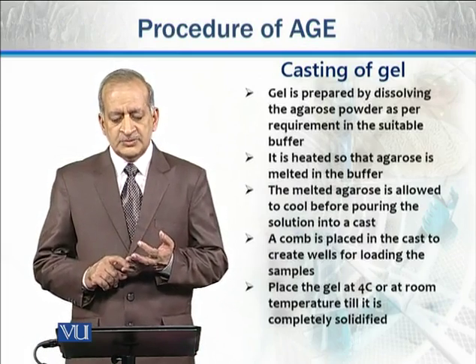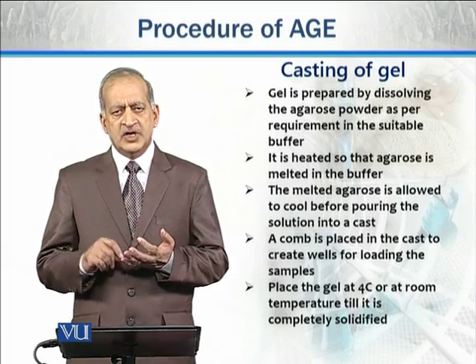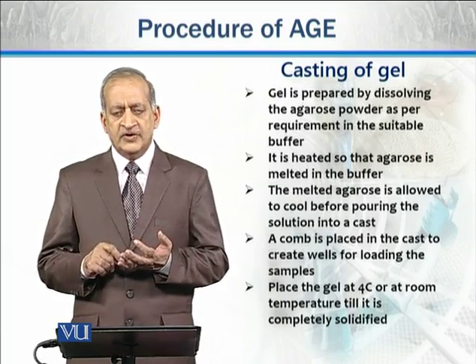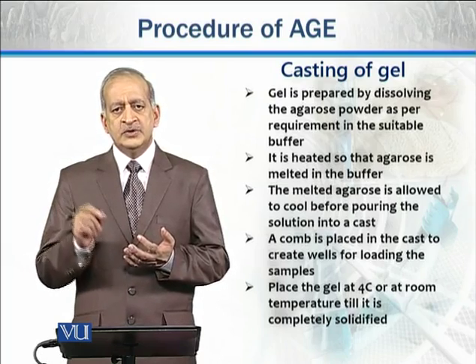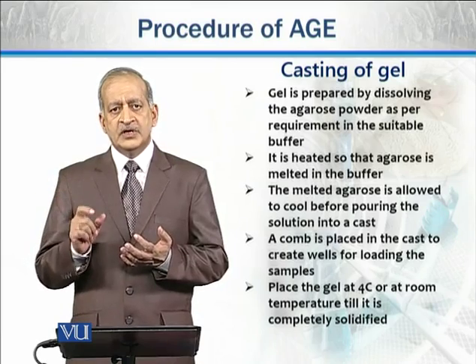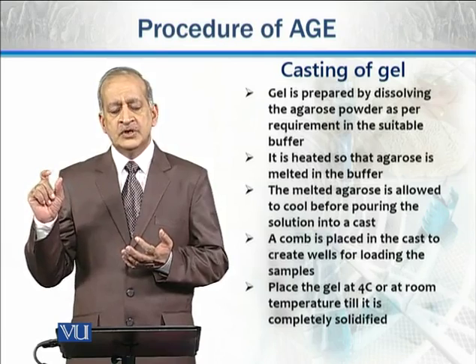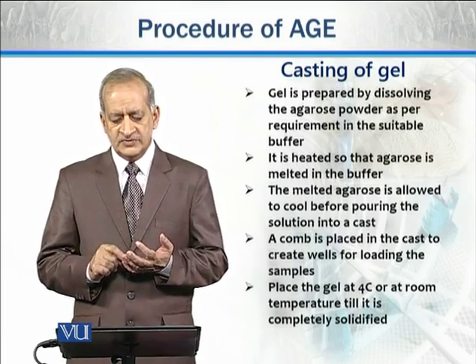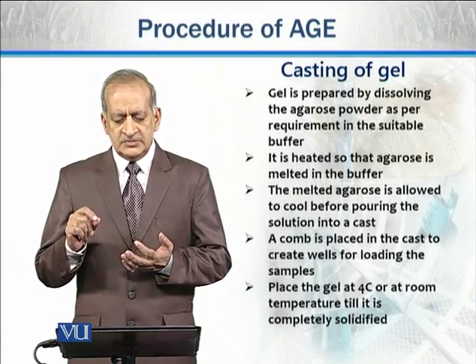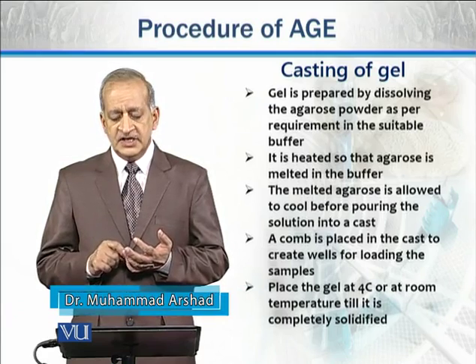First of all, gel is prepared by dissolving agarose powder as per requirement in some suitable buffer. If we want to separate smaller molecules, we use higher concentration. If we want to separate larger molecules, then we use low concentration of gels. Then it is heated, so that agarose is melted in the buffer.